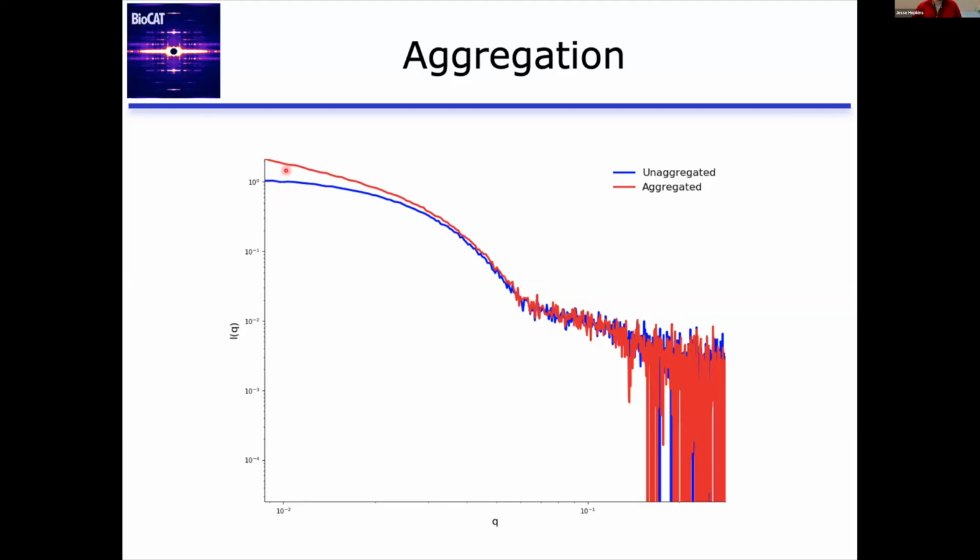And this is a very clear signature of an aggregate, or of multiple sizes of samples in solution, even if it's not non-specific aggregate, perhaps multiple oligomers. The basic idea here is big stuff scatters more at low Q, so you're going to see these overall size-dependent changes show up more here. It's also related to the Guinier range, which we'll talk about in a few slides.